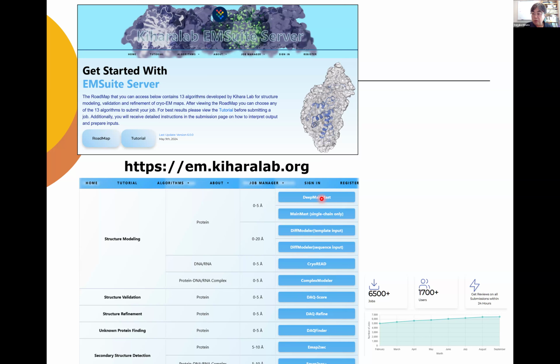Of course, all these methods have source code available on GitHub, and some are also available in SBGrid, but I think this server gives you a quick start because you don't need to do any installation. All right, then I will pass this to Genki.